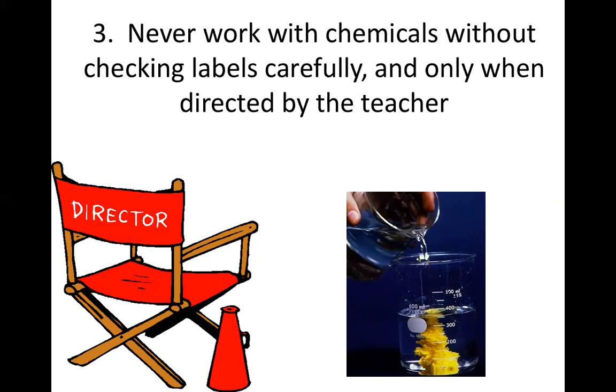If you are using acidic chemicals or acid, you have to wear the proper equipment. You have to wear acid resistant gloves, not just any kind of gloves. You also have to wear your safety goggles, and it's better if you are wearing your laboratory gown. Knowing what kind of chemicals you're dealing with helps you prepare not just what you are wearing, but how you are going to act with it. And if it's flammable, of course, you have to place it away from any source of fire. For example, if one group is heating water, you do not open that flammable chemical near the group that is using fire.